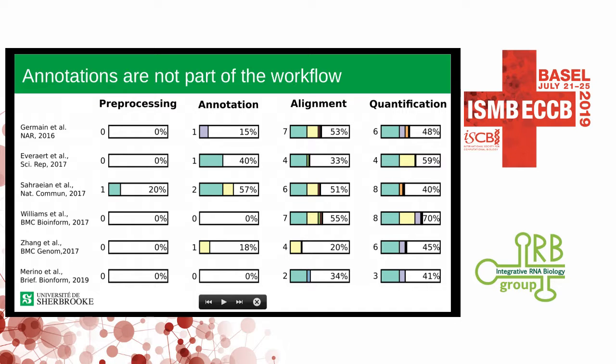Mainly we can see that they only consider alignment and quantification as being part of the RNA-seq workflows, whereas for annotation only one article has used more than one. And these annotations have only been used to identify transcript assemblies, and they have not been compared in quantification. So we currently lack a meaningful comparison of a workflow-wide RNA-seq benchmarking.